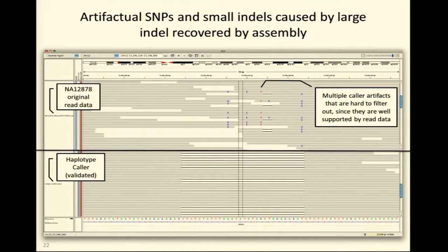So this actually is a huge improvement, but you wouldn't be able to see this just with a locus by locus view as unified genotyper, and that's why you need all of these more sophisticated assembly methods to actually get these large deletions. And so with haplotype caller, depending on your data, we can reliably get up to maybe 70 or 80 base pairs. It depends on the data and the length of the read.